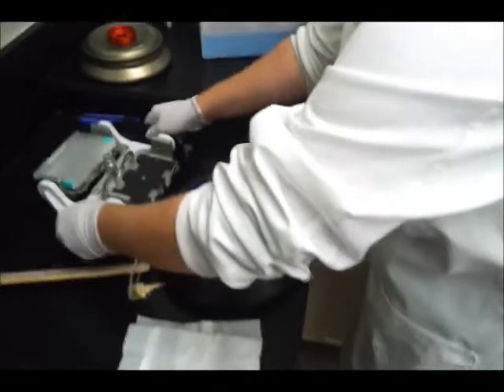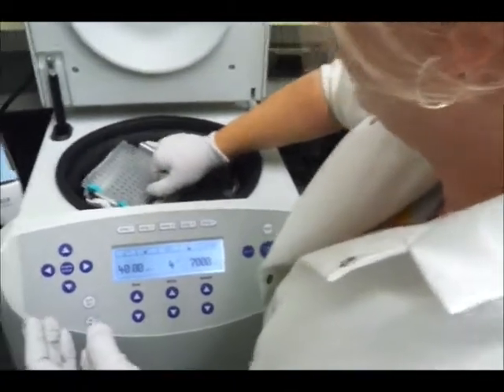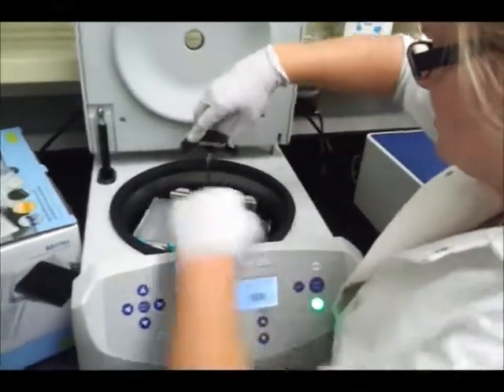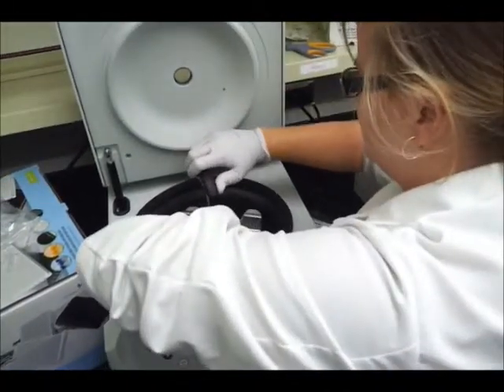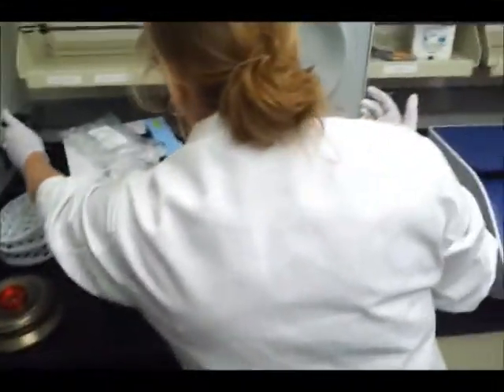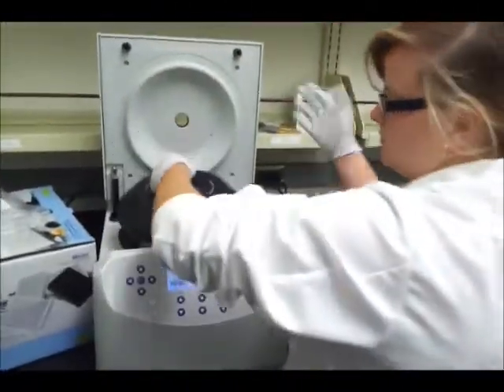And then you put this one in. And let the record show it's not a screwdriver. Whatever it is, it's an Allen wrench. Gotta secure this guy with the Allen wrench. So you hit resistance, hold this guy, push this guy. How tight do you do that? I do it as tight as I physically can. Oh, okay, wow. There have been times when I'll go to run it and it'll say, rotor not secure. And so you have to, you know.